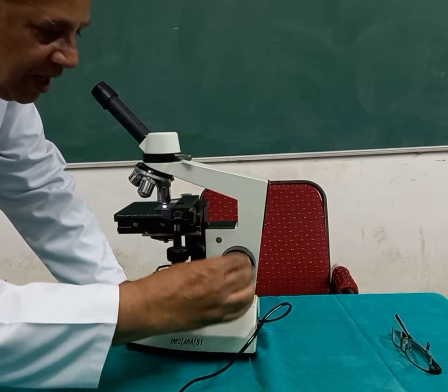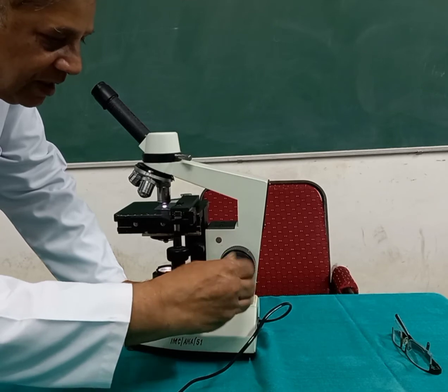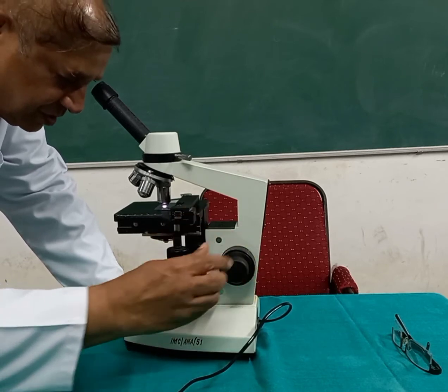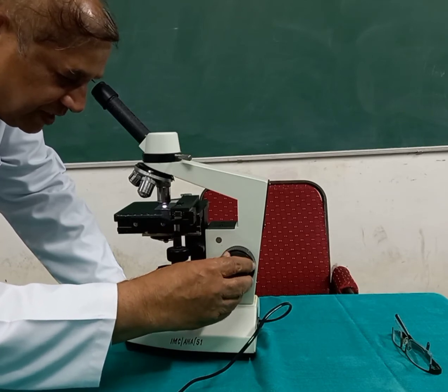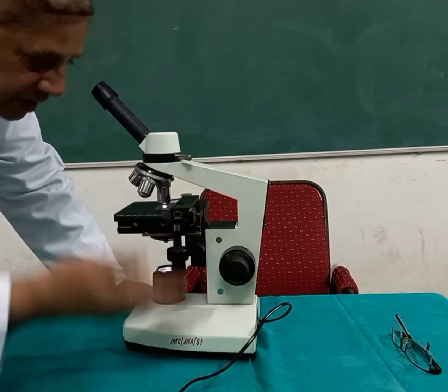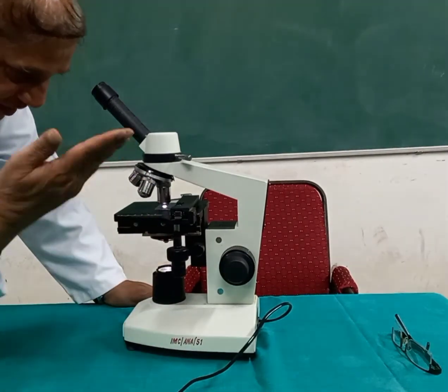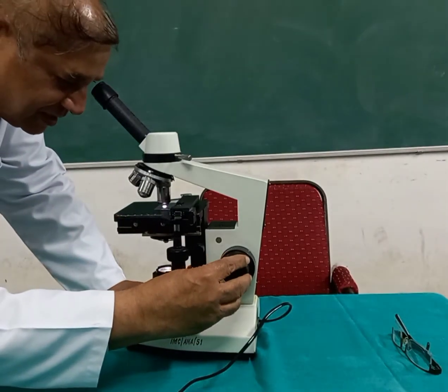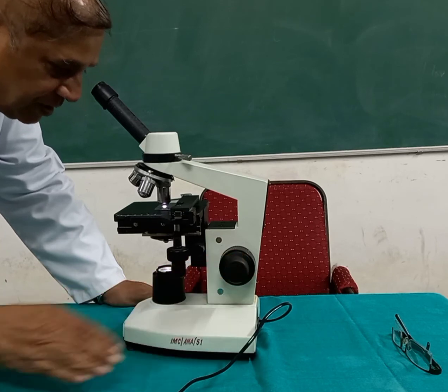You see that I am moving the fine adjustment in either direction. A lot of movements are being made, but your slide is not going to break because it is the fine adjustment which will focus it very nicely without moving the stage of the microscope. So the slide is not moving up and down, so it will not touch the objective lens and the slide will not break. So this is the very important step.